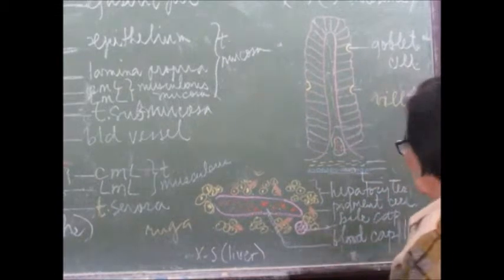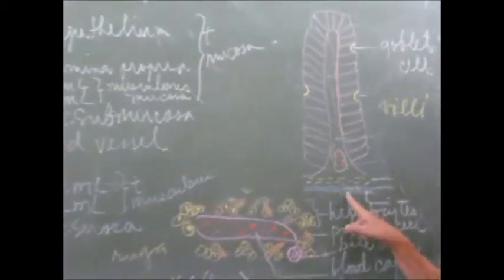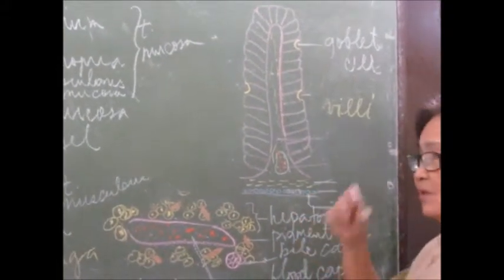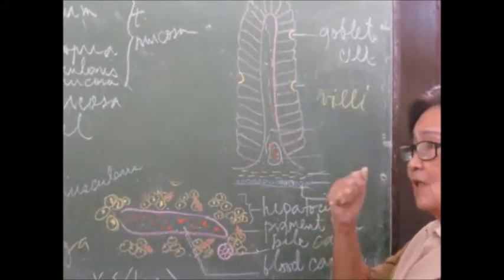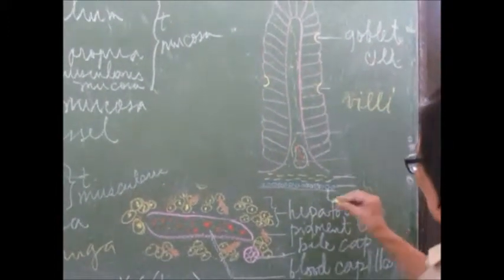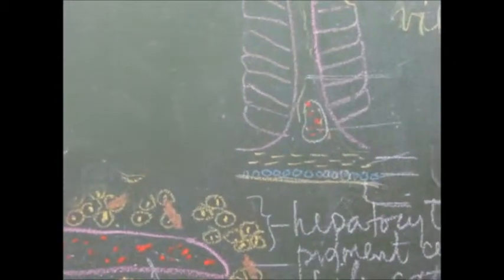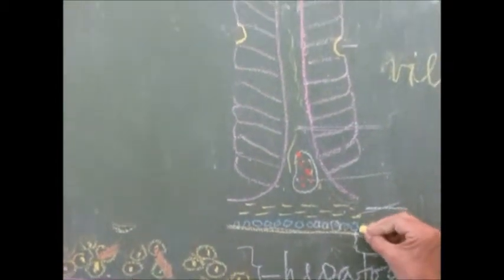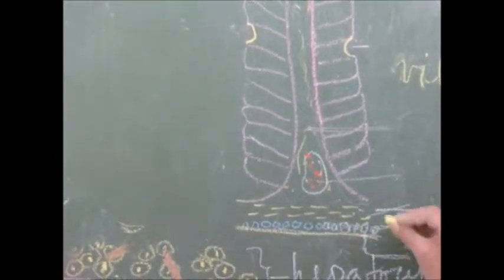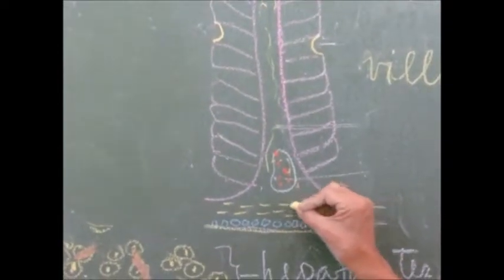Now, just like the stomach, the contraction of the tunica muscularis will enable the food to be pushed down to the lower part of the digestive system, correct? Now, the outermost is the tunica serosa, followed by the longitudinal layer. Then you have the circular layer.